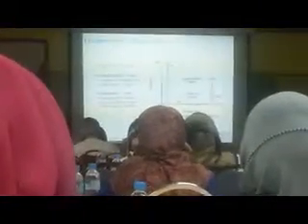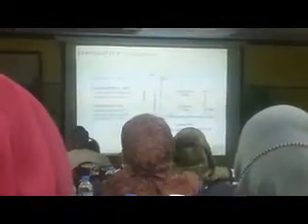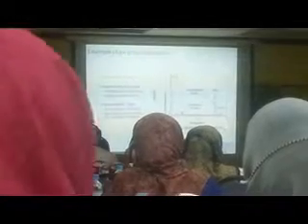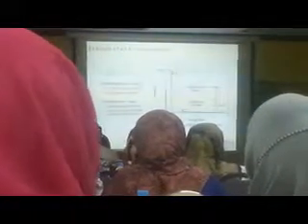When you bombard a sample with electrons, it emits X-rays. It emits two types of X-rays. One is characteristic X-rays, the other one is continuous X-rays. So this is the X-ray emission from any sample. You have characteristic X-rays and you have continuous X-rays. So what is the difference between them?